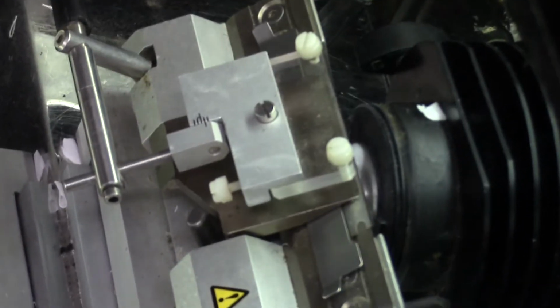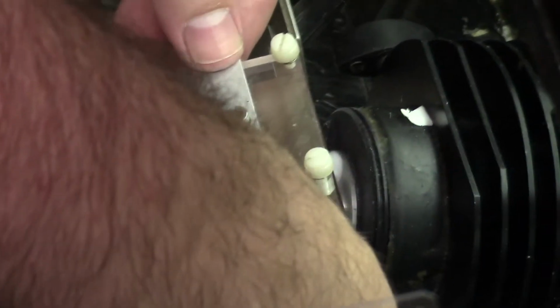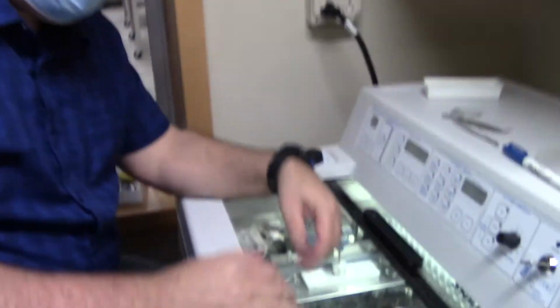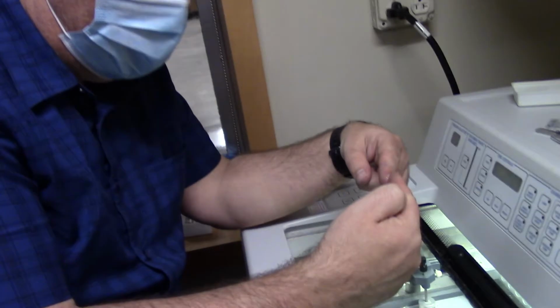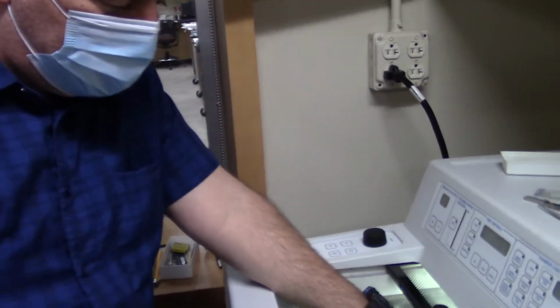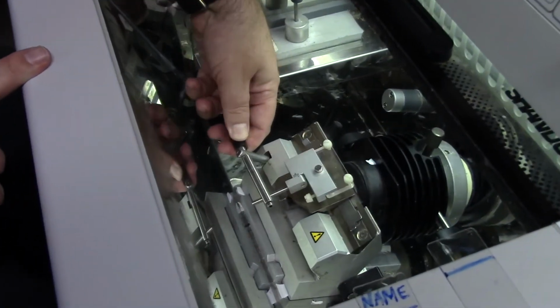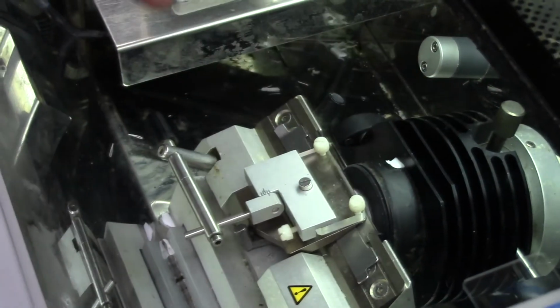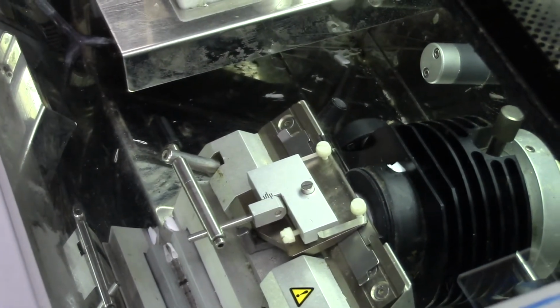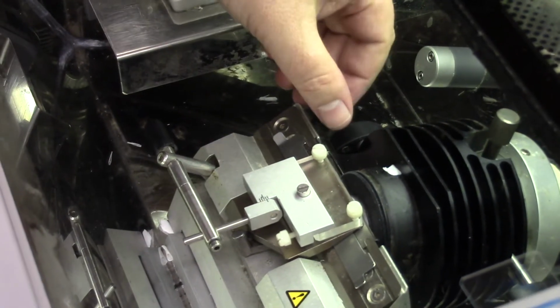There's a marker right here that indicates what angle the glass of the roll guard is at. So I'm going to change that angle a little bit so that there's more of an angle. So what happened on that last section is the tissue rolled up instead of going under the glass of the roll guard. This knob right here controls where this rotator is located, and I want the glass to move forward so it hangs over the edge of the blade. So as the tissue touches the blade, any tissue that's coming off will go underneath the glass.